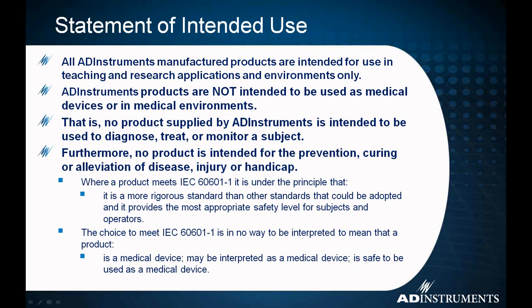Quite often we get a variety of questions about how I can use my ADInstruments equipment. How can I use LabChart? What can I use it for? You don't have to go through here and read and memorize all of this, but the take-home message is that ADInstruments products are not intended to be used as medical devices or in medical environments. They can be used in clinical research, but they cannot be used to diagnose, treat, or monitor a subject. So definitely research only. Cannot be used for actual treatment.